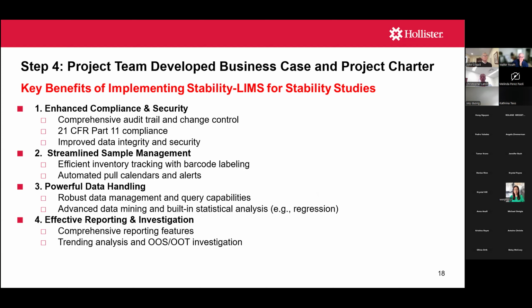Built-in statistical analysis, regression analysis would be a very important feature. Again, we would no longer have to rely on our clinical stats group to perform those types of analysis for us, and it would expedite things because it would be in our control. We would no longer have to wait 3 or 4 weeks for the clinical stats group to turn around such a report.